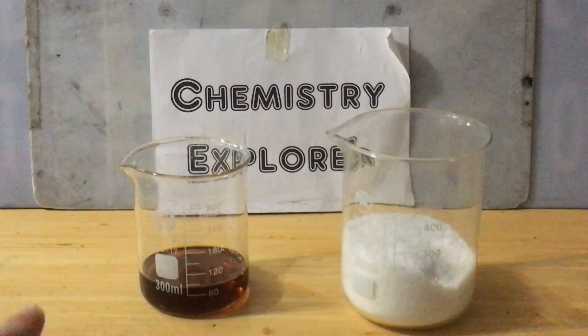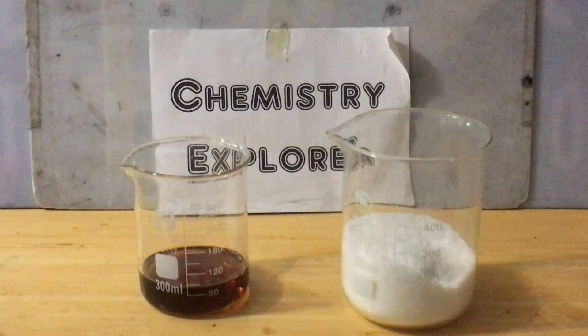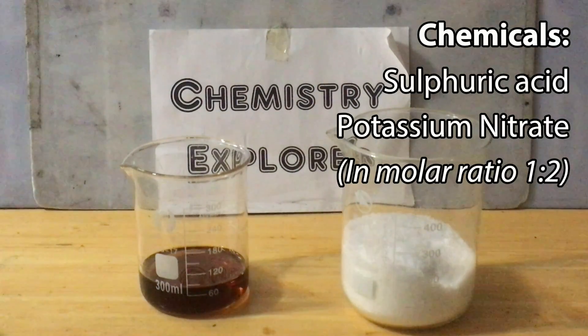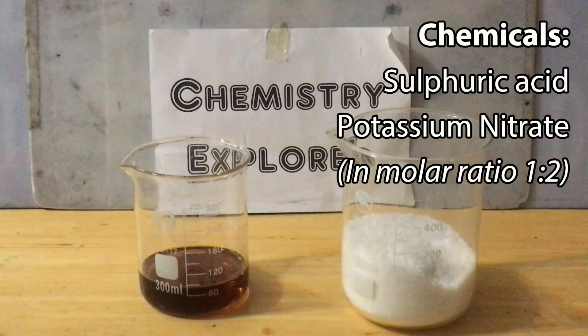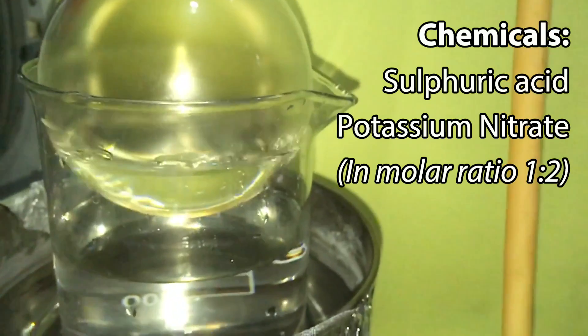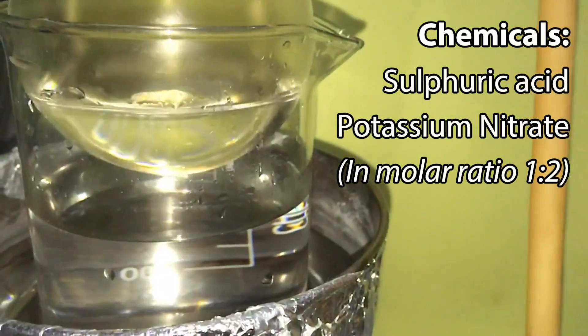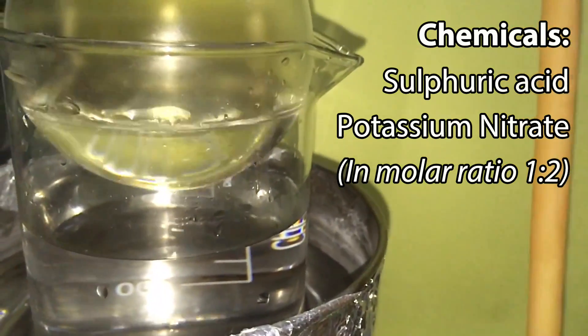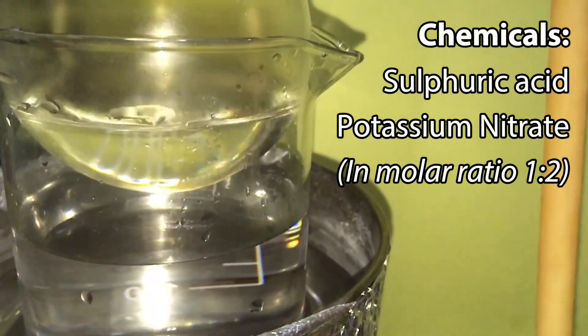For this reaction, you only need two chemicals: potassium nitrate and sulfuric acid. You can actually use any of the nitrate salts such as sodium nitrate or ammonium nitrate if they are easy for you to get. But if you are using barium nitrate, calcium nitrate, etc., you should make sure that they are all dissolved in water before adding the sulfuric acid. I will tell you why in a moment.